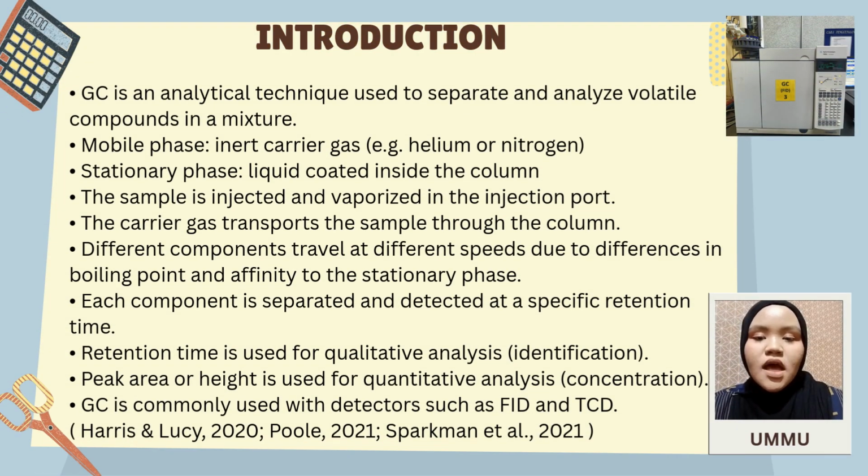Hi, I'm UMMU. I will explain the introduction. Gas chromatography, or GC, is an analytical technique used to separate and analyze volatile compounds in a mixture.